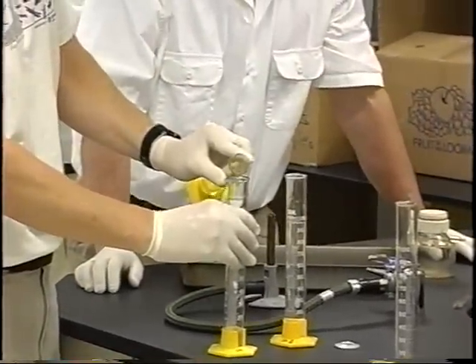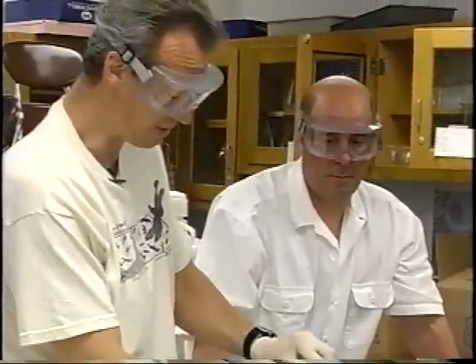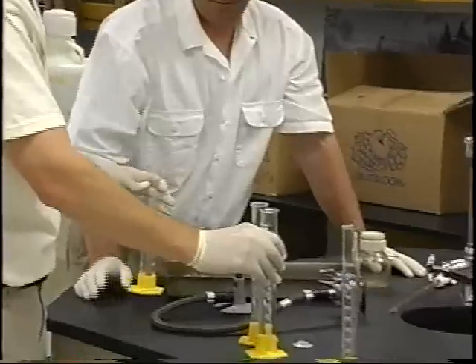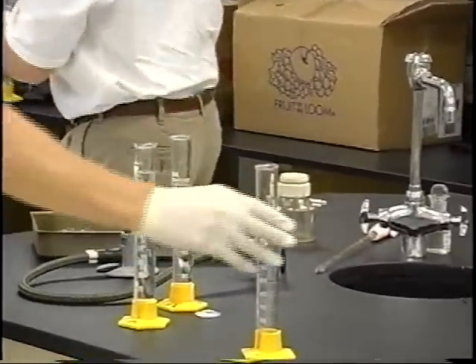So the one I'm mixing now is only 10% as strong as the first one, but there's still enough bacteria in that water to show us some results. One more time. Now the last time, since this is our last one, this is 0.1% strength.